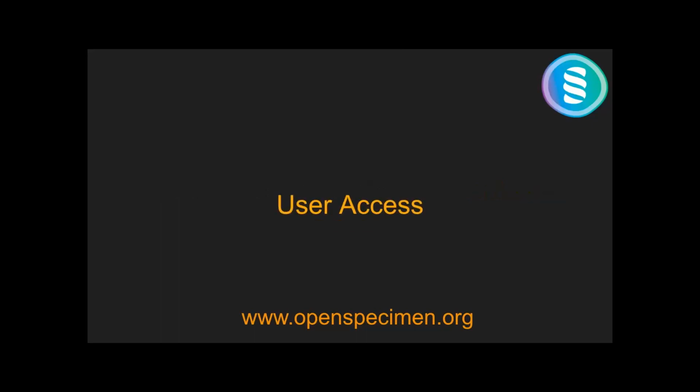First part is about the user access. Which users are going to get access to specific containers? Now, this is the most complex part about how the containers are managed. The first part is related to the sites.